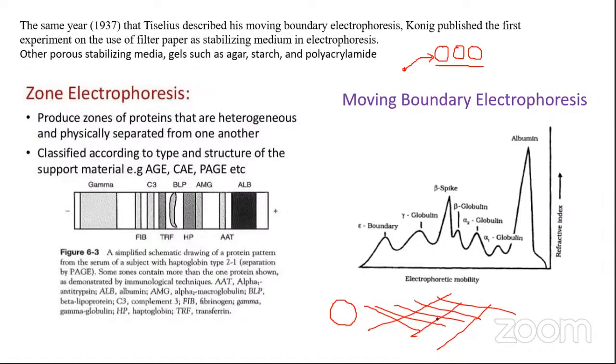Those pockets are filled up with the liquid medium. And because it is a colloid, you cannot work with two separate entities. If you separate one from the other, then both will not be stable. You cannot separate the solid from the liquid. The solid portion will dry down and will never gellify unless you put it in contact with the liquid. Is this much fine? Should I go ahead?